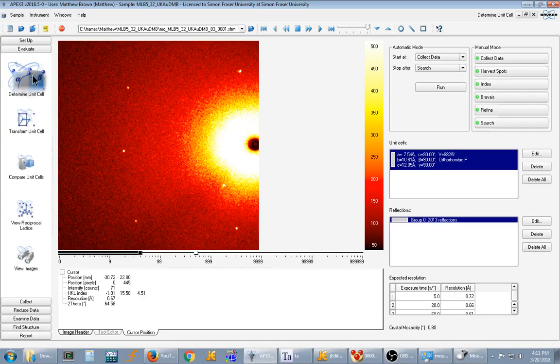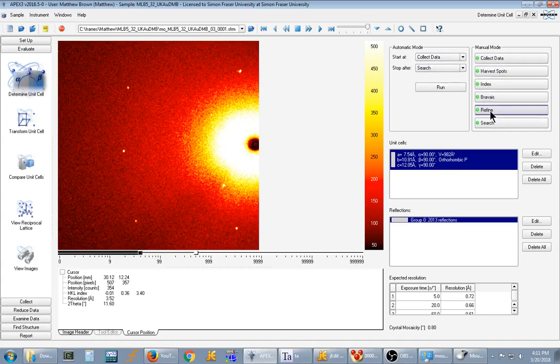So to use this you simply go to determine unit cell, solve your unit cell as normal, and then you'll notice an additional button here under manual mode labeled search. You click this.